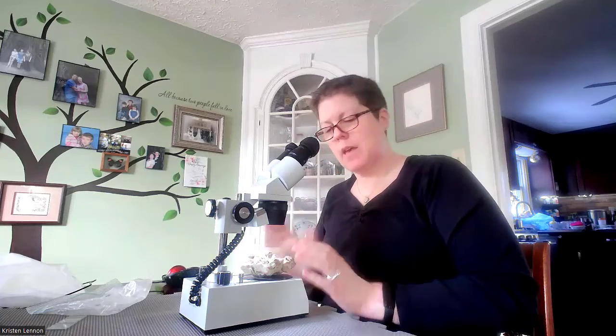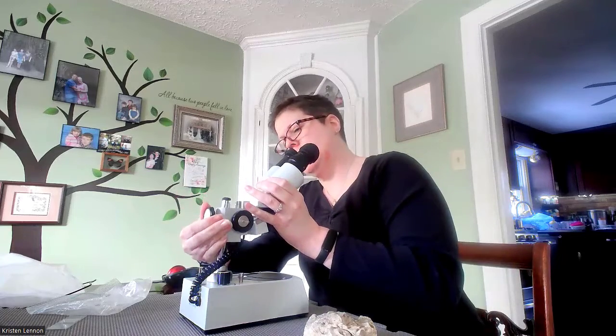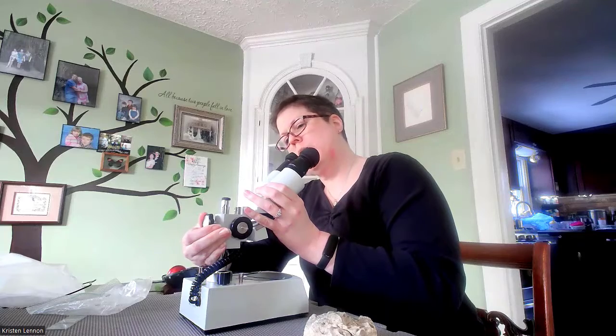Now, I would recommend when you're done, take this off, turn your lights off, and then return this to about the central position. That way, when you come back to use it again, it will be all set up for you in that position. All right, enjoy your microscope.